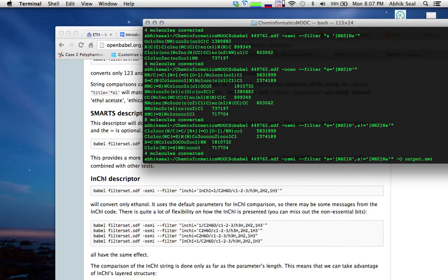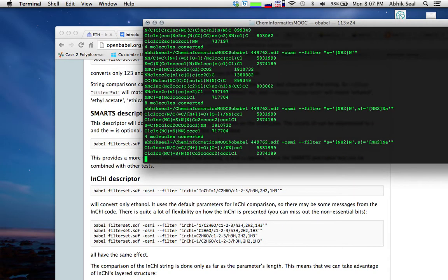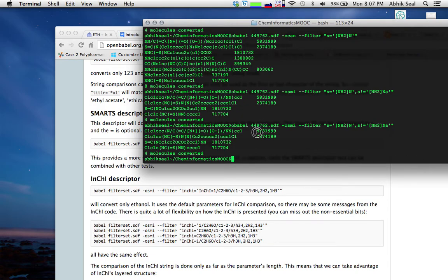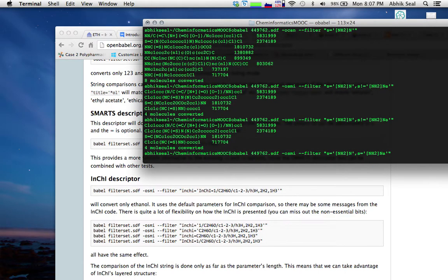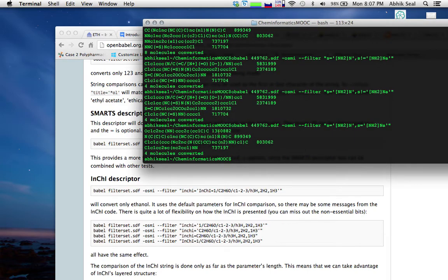The command uses 'obabel' on the input SDF file, outputting in SMILES, and filters compounds which contain 'NH2-N' and do not contain 'NH2-Na'. You can see on screen which compounds pass this filter from the larger dataset. If you remove the 'not equals' sign, it shows the four molecules which contain both SMARTS patterns. You can check which molecules match only a specific pattern in the full dataset.